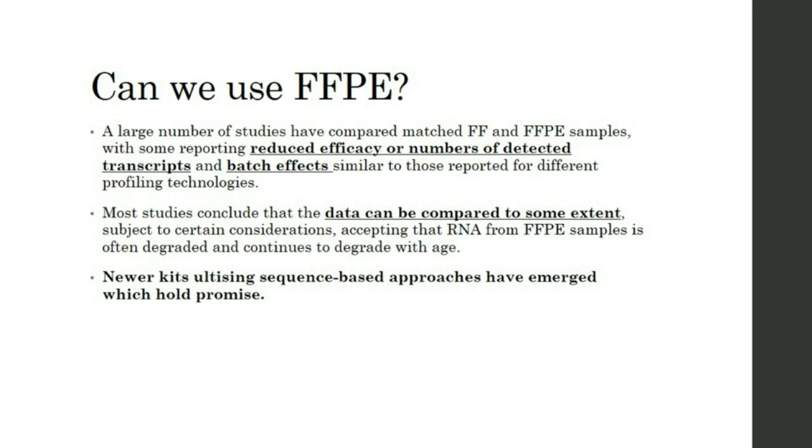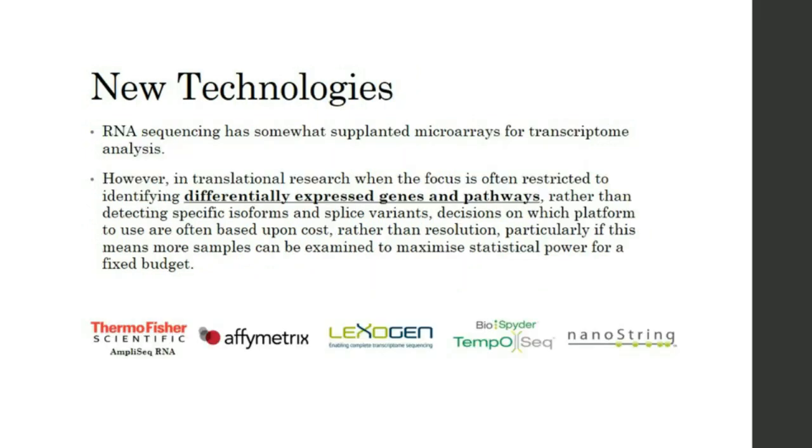What's really promising is that newer kits and newer sequence-based technologies have emerged which hold real promise for the processing of these FFPE samples. So new technologies really stemmed, I suppose, from RNA sequencing. And we've done a bit of RNA sequencing ourselves. And really, I think this has probably supplanted microarrays for transcriptomic analysis.